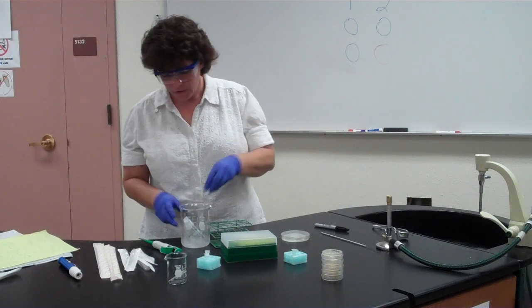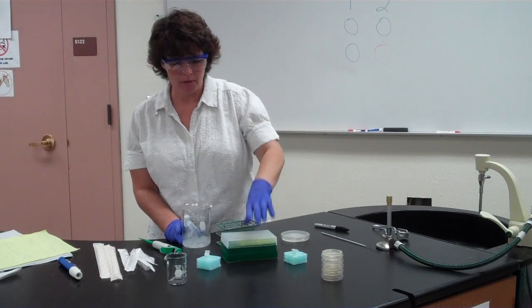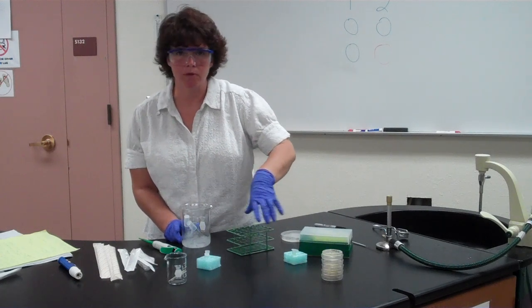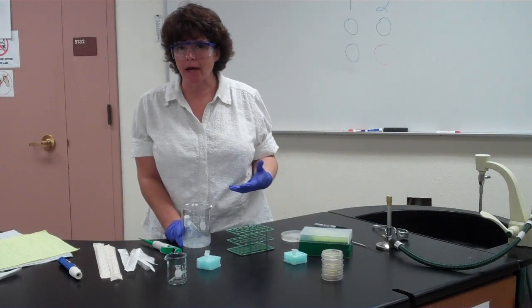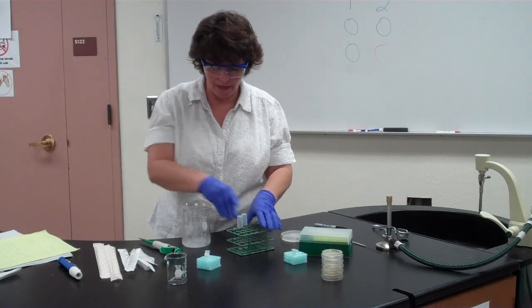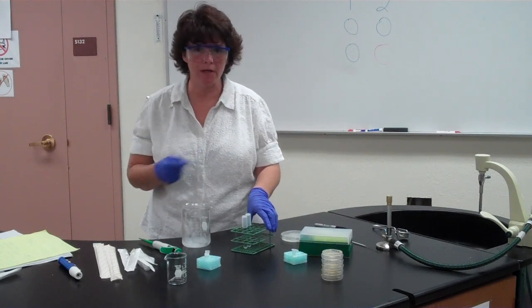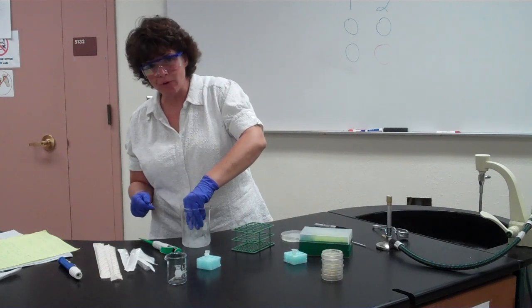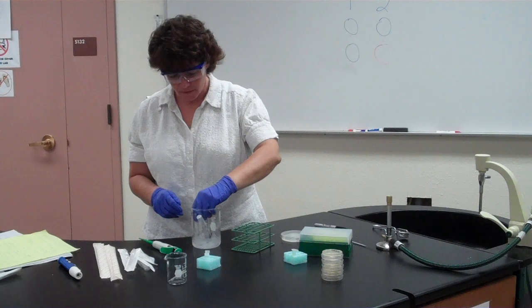You're going to heat shock the tubes for exactly 90 seconds. While they're in the water bath, agitate them slightly — just move them a little bit. If several groups go in at the same time, one person can handle the agitation. One person in the group needs to be timing while the other is agitating. After exactly 90 seconds, pull them out and place them right back in the ice.